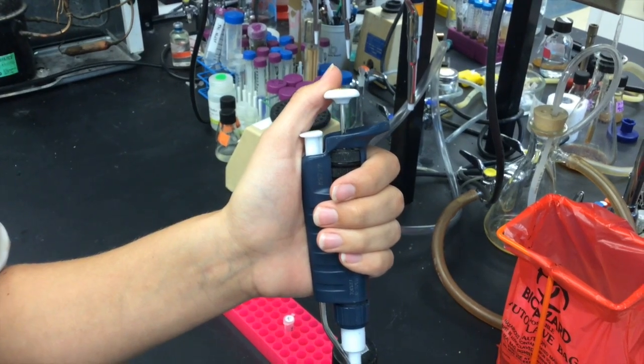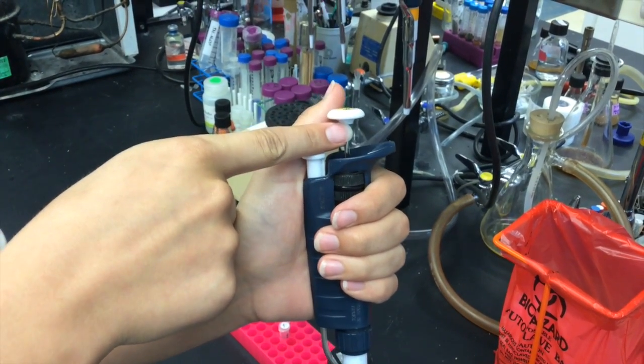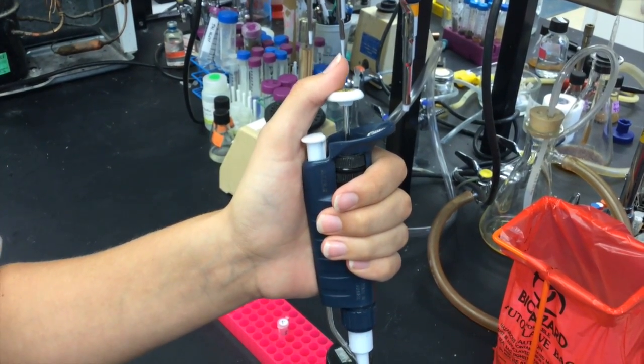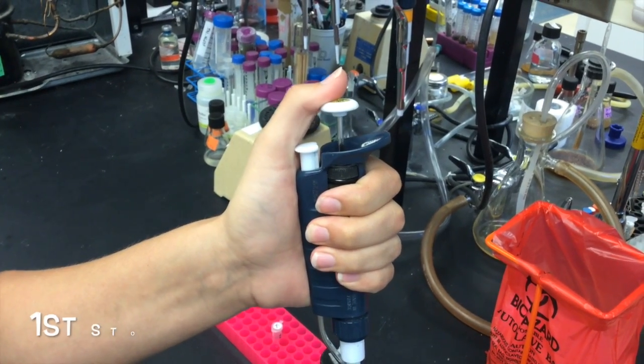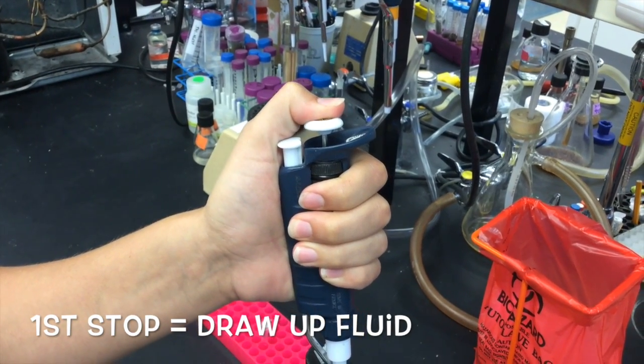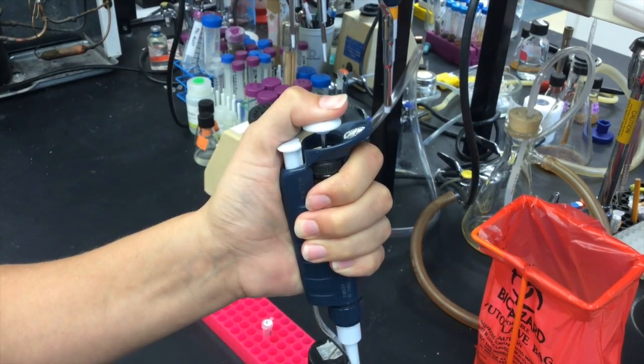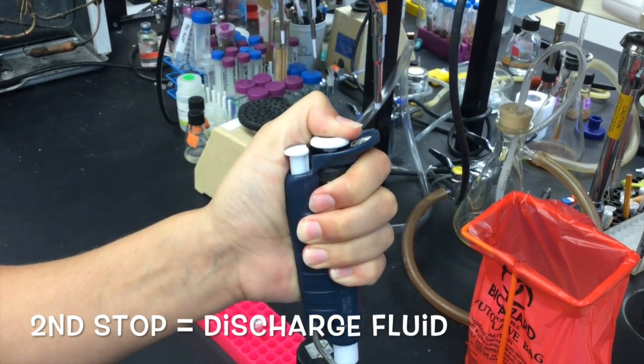On the pipetter, there is a main plunger. This plunger has two different positions when it is depressed. The first of these stopping points is used to expel air before drawing up liquid. The second is to discharge the liquid.